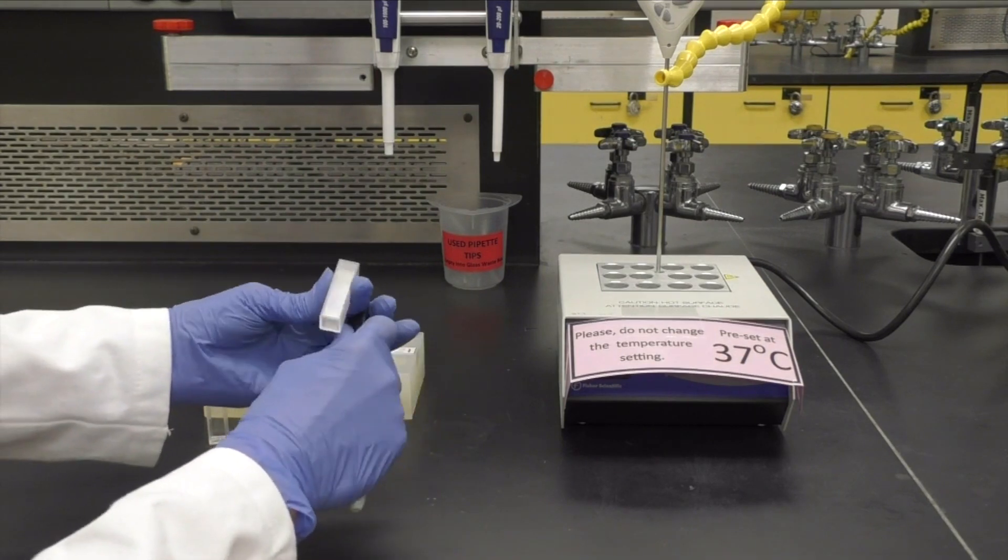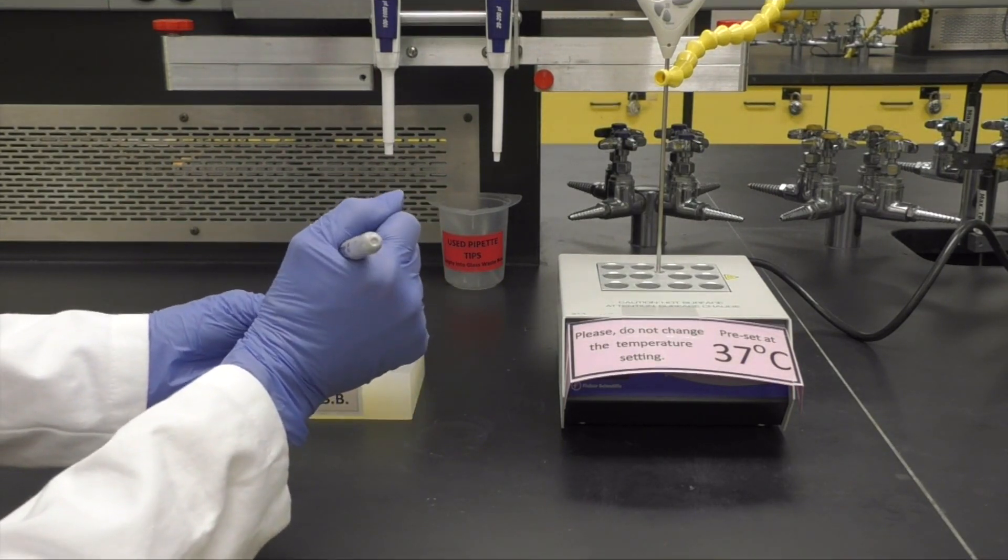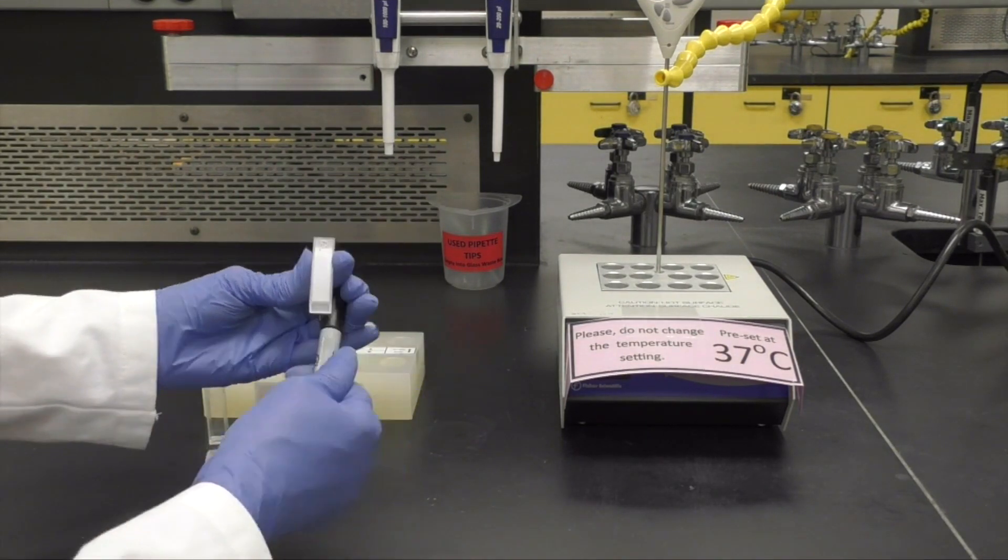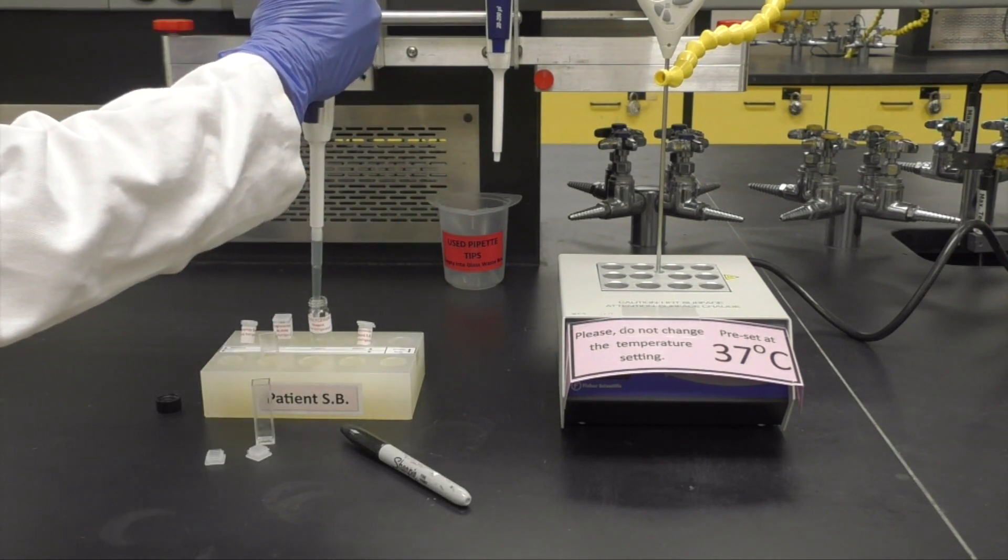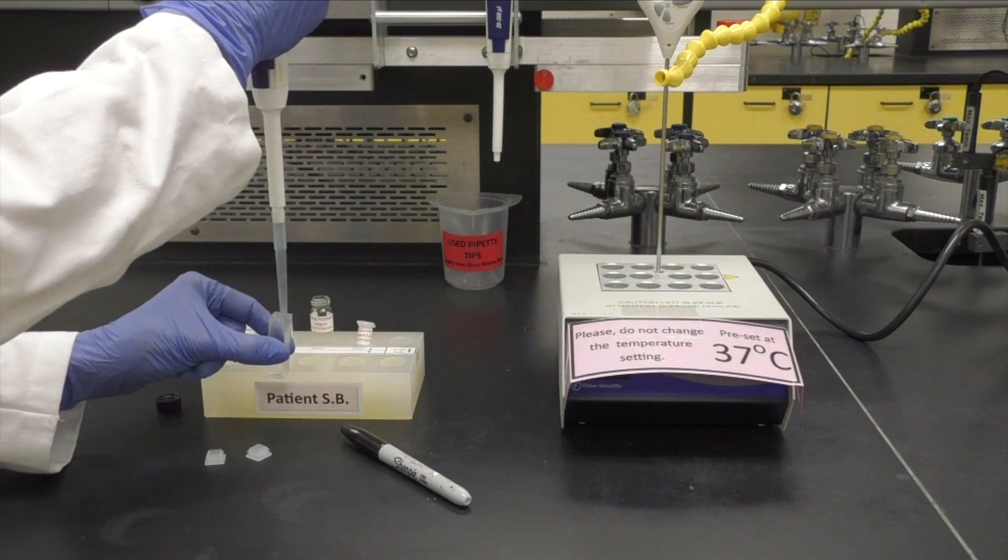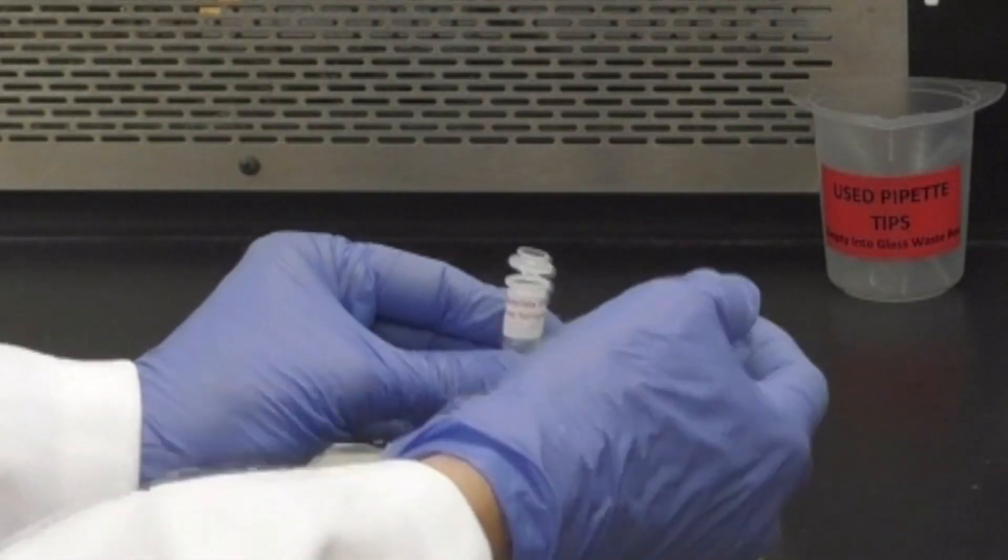To prepare your samples, use a sharpie to label your cuvettes. Add 1 milliliter, in other words 1000 microliters, of the triglyceride reagent to each cuvette.